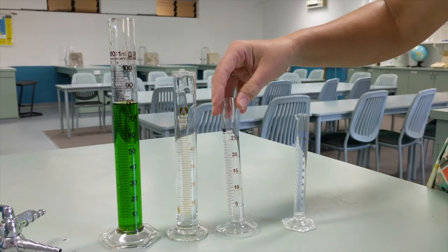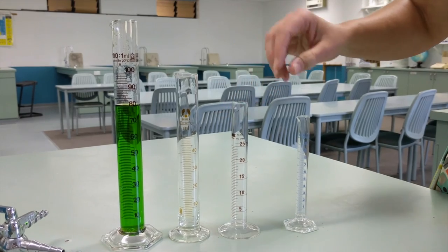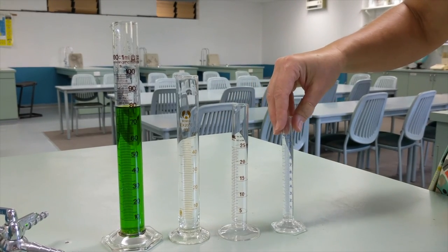For less than 25 mils, I'd use this one. Or for 10 mils or less, I'd use this one.